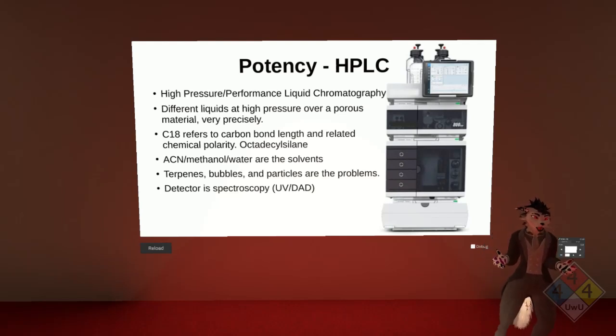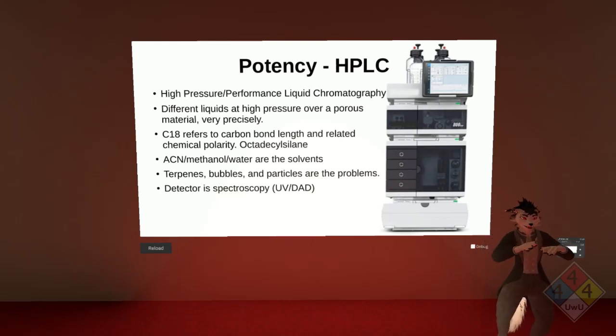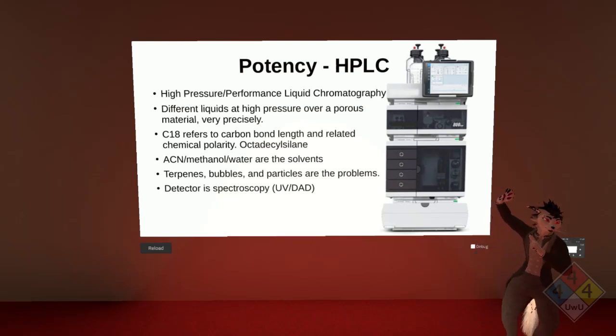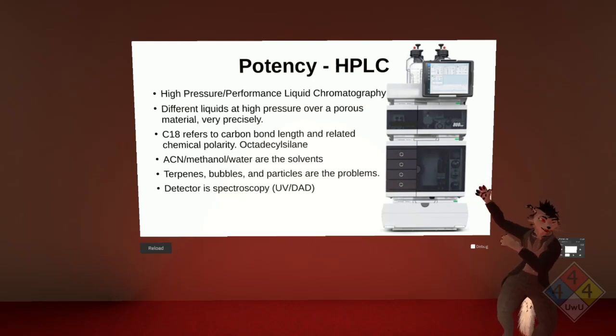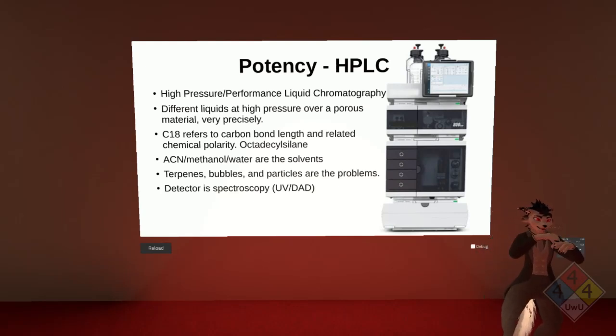Now, of course, how much solvent do you use of each? Like, is there some sort of ratio? The answer is yes. There is a ratio. In fact, it's the entire ratio. And this goes a bit beyond my understanding because this is engineering, but these guys use some very interesting quaternary pumps in order to develop a fluid gradient. And if you think about it really closely, it's actually difficult to have a fluid gradient from 100 to 0% of anything without it being in fractions, right?